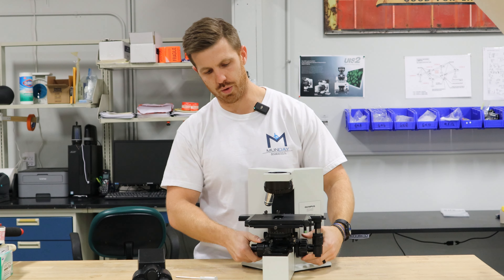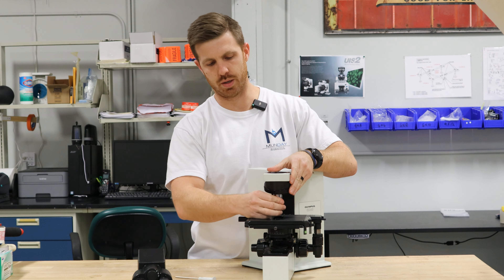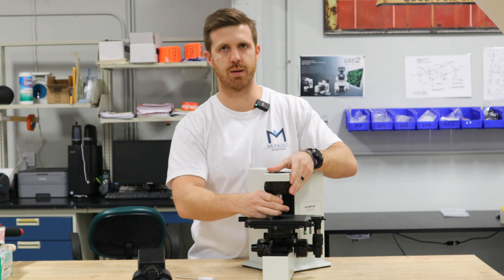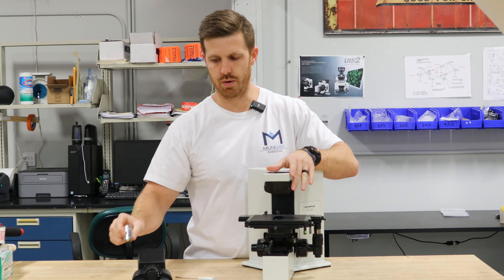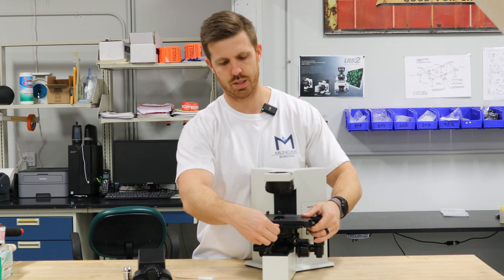So then we're going to lower the focus and there's going to be several objectives on here. Typically this one, we just have one for an example. So screw that off.